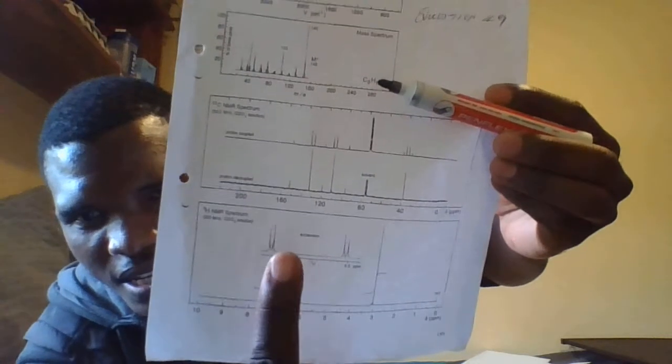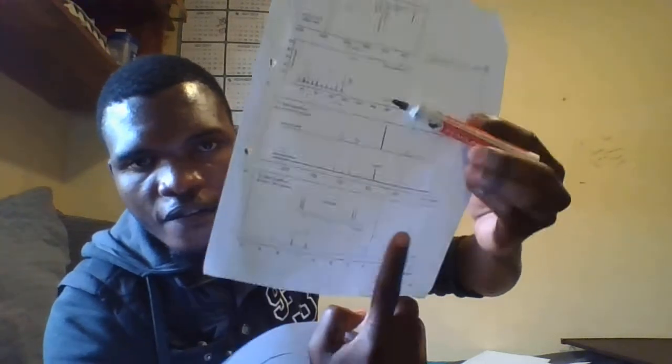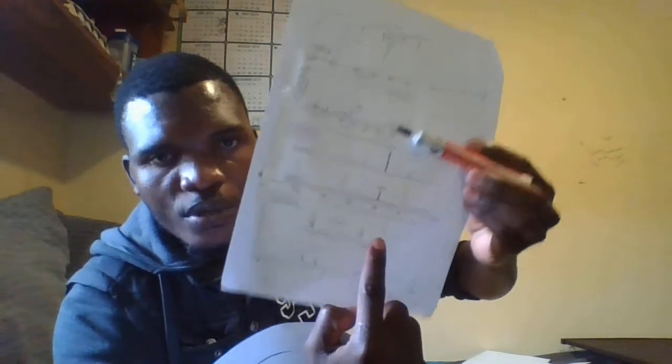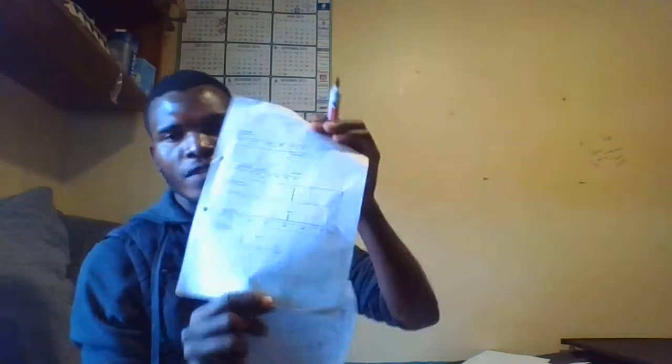But I don't think it has a part to play, because as you can see, we have these doublets due to the two pairs of hydrogens on the benzene ring, those two pairs of equivalent carbons. Then we have a singlet due to the CH3 carbons attached to a nitrogen. So basically this is the interpretation of this spectra.